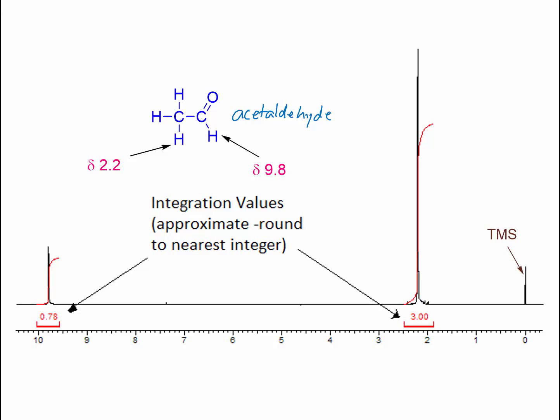Okay, so you can adjust the mode of the spectrometer to just measure the area underneath each peak. We'll call this X. And if we integrate here, sorry, that's not a really good straight line there, is it?